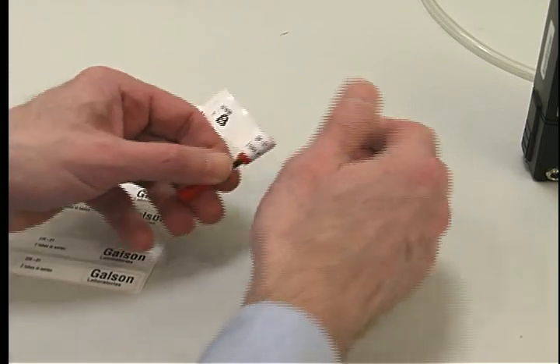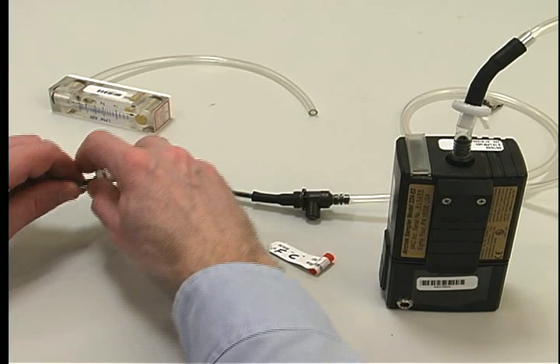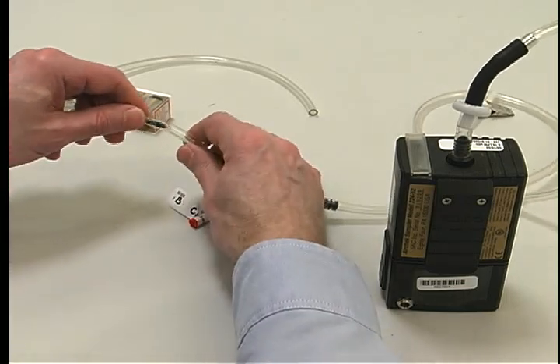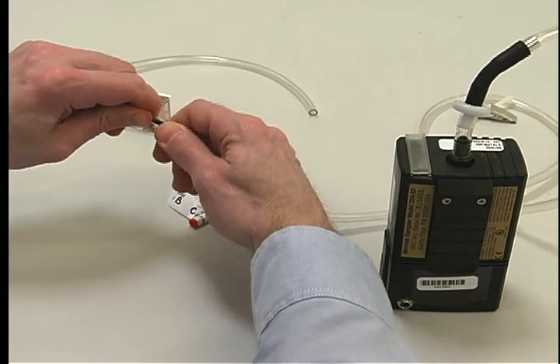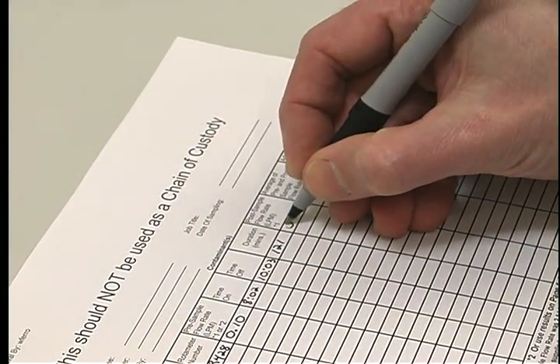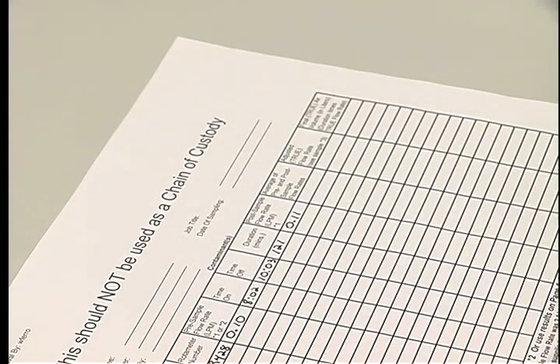A post calibration must be performed on the pump. Perform the post calibration the same way you did the pre calibration, using the marked calibration sorbent tubes, but do not make any set screw adjustments. Just record the flow rate on the pump calibration sheet. The pre and post rates should be within 10% of each other.